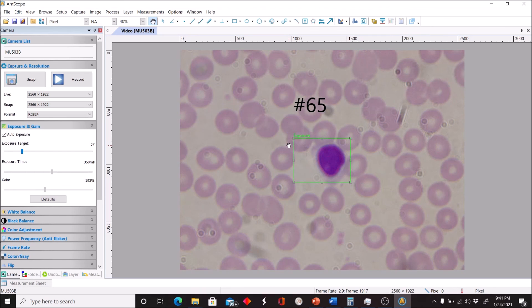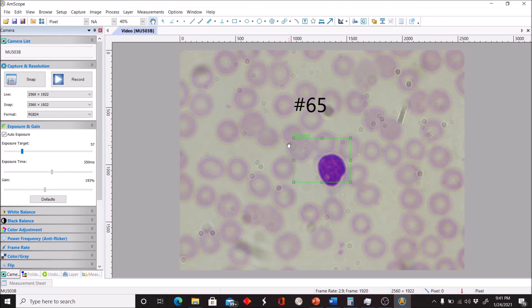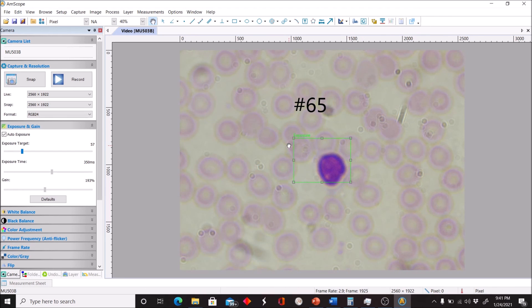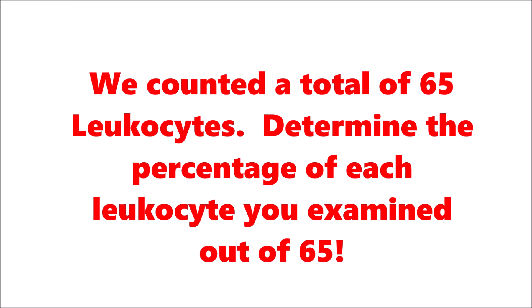And last but not least, we'll end on this guy. That completes our differential count.